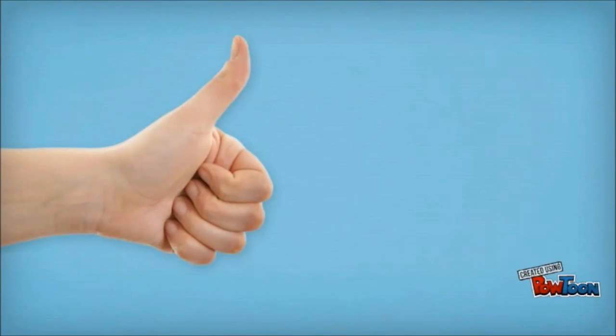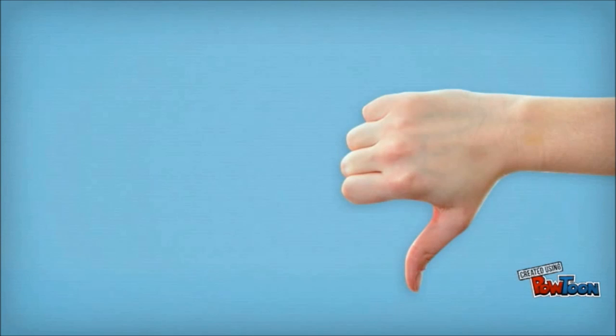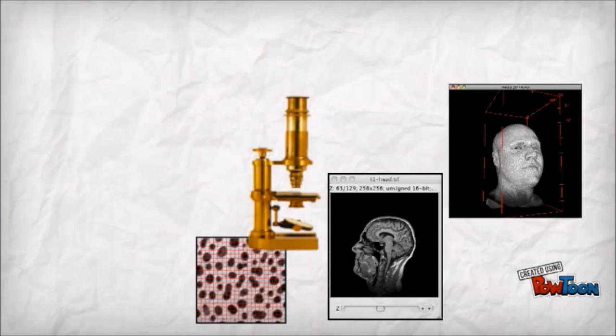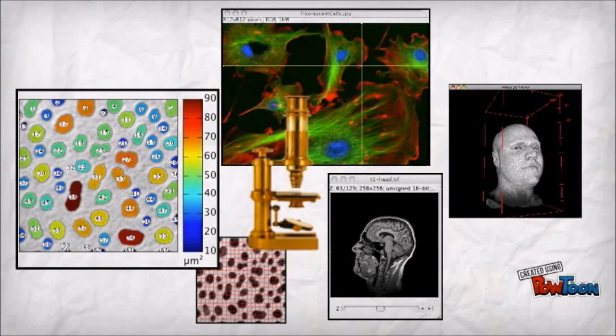That was pretty cool, huh? But unfortunately, this tutorial has come to an end. Please note that we only briefly touched the surface of ImageJ, and there's lots and lots of more amazing stuff to explore. Have fun!